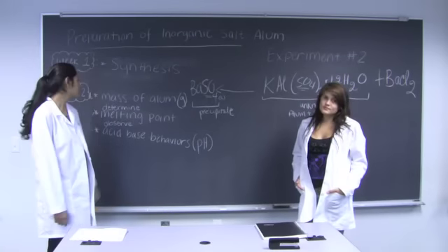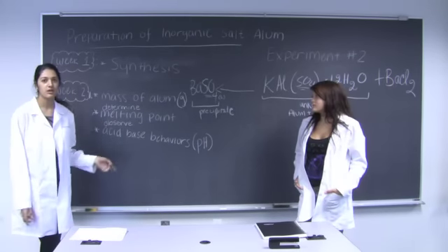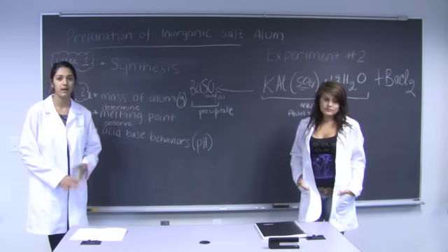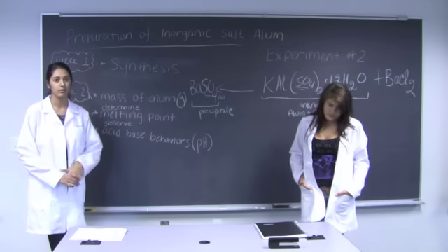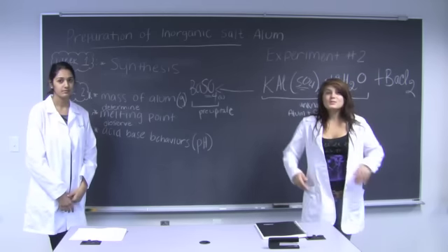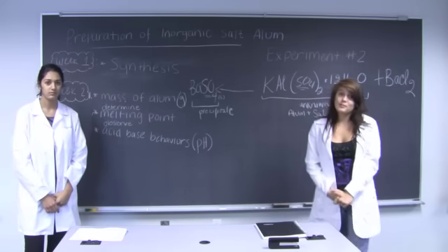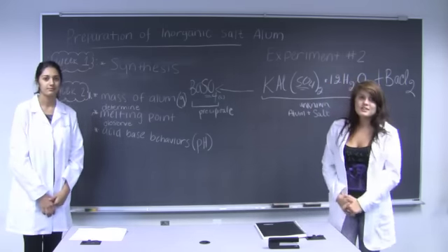Be sure to record the melting point, the pH, the mass of the alum, the mass of the BaSO4, which will eventually lead to the mass percent of alum, in your lab notebooks. And be sure to read over your packets thoroughly and take the readiness test online before coming to class.